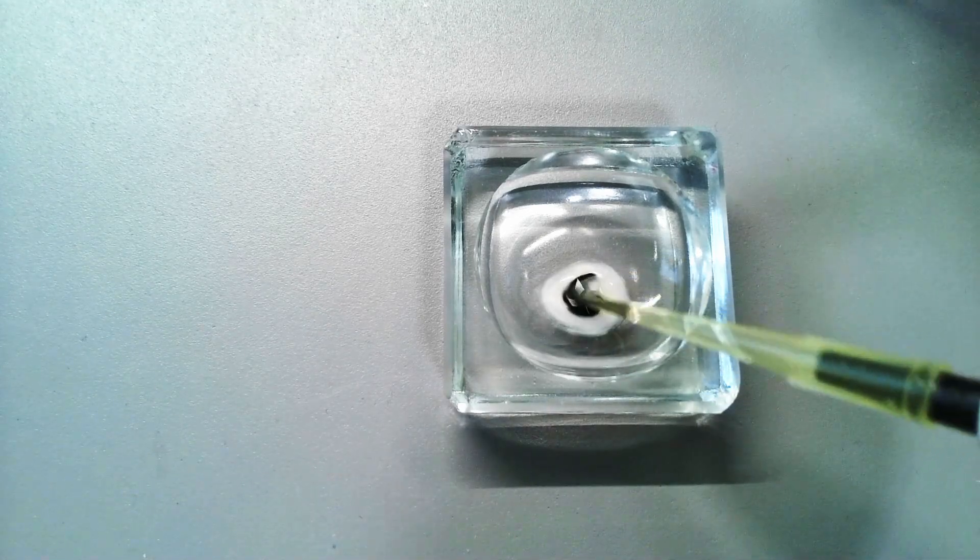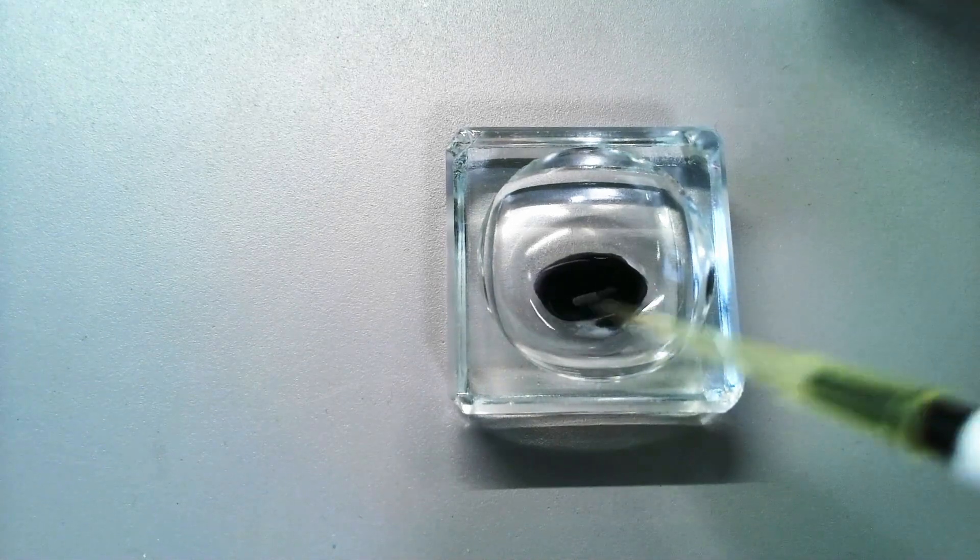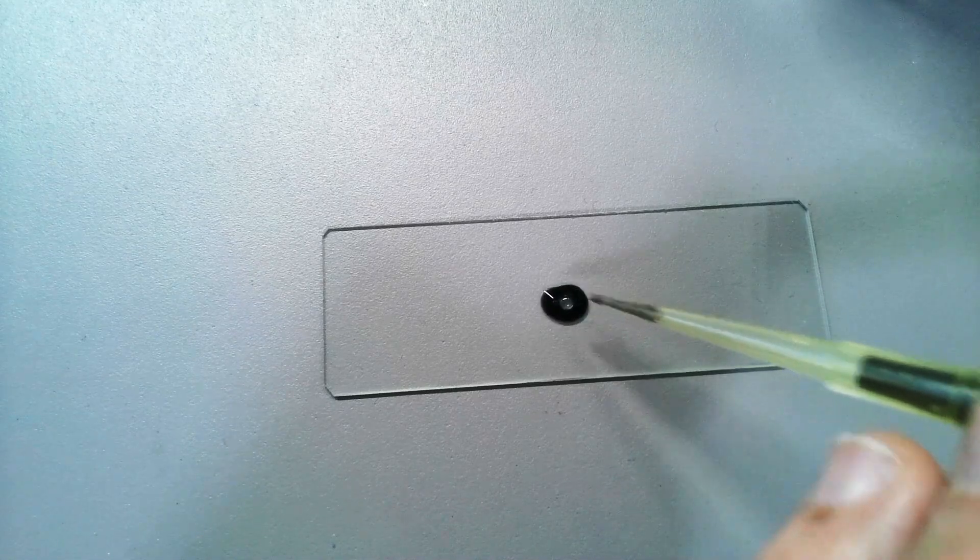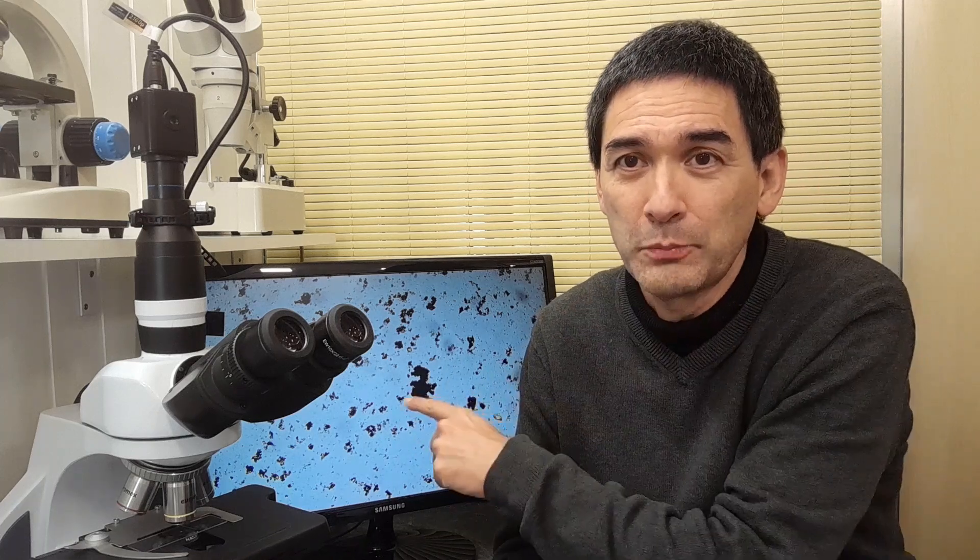And I mixed it with a small amount of iodine solution to turn the starch black. Therefore, you're able to see it better under the microscope. That is actually a very common test to test for the presence of starch - mix it with a little bit of iodine and it turns black. That's what we see here on the screen, those black spots, individual starch grains from the rice wash water.